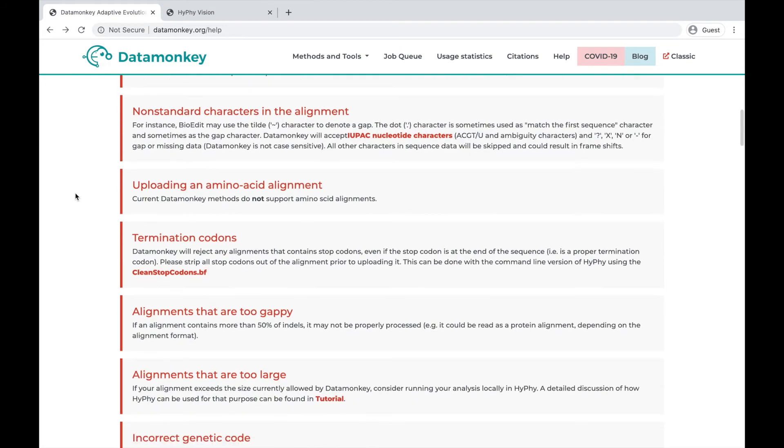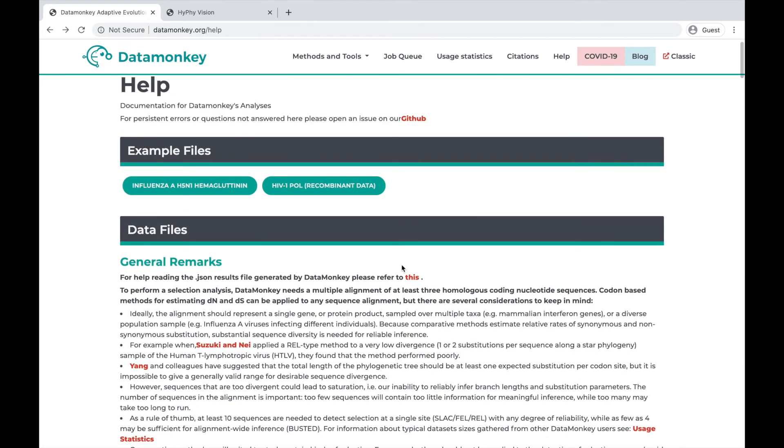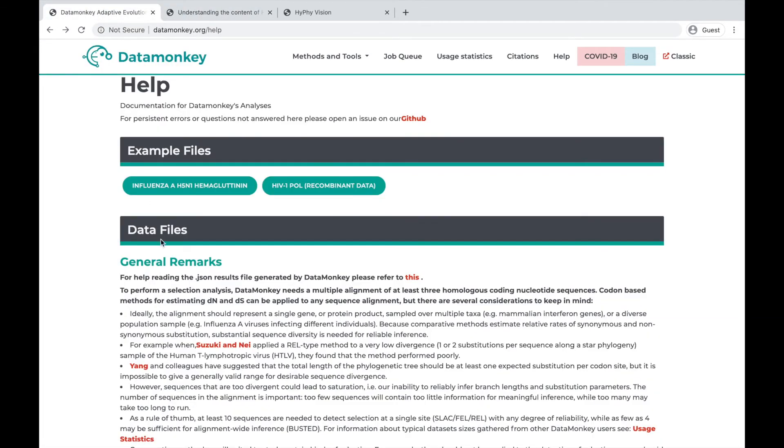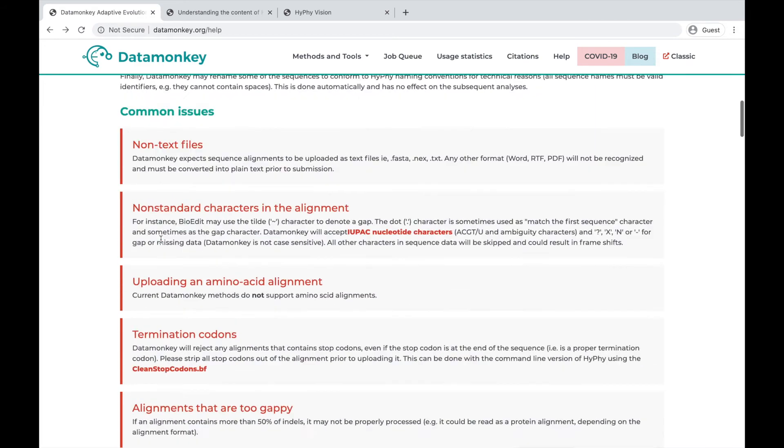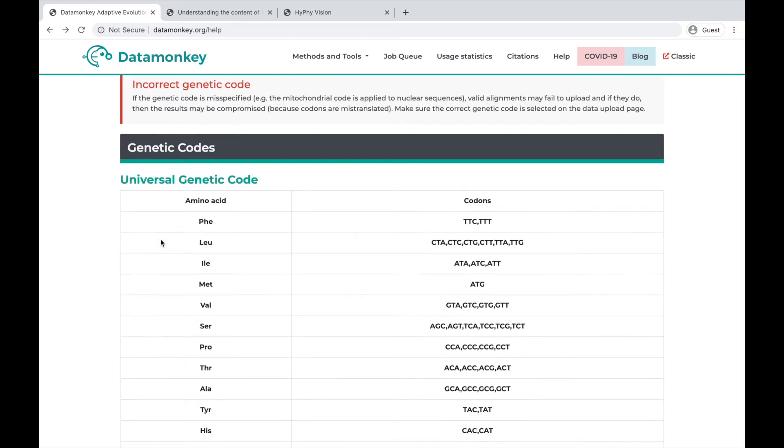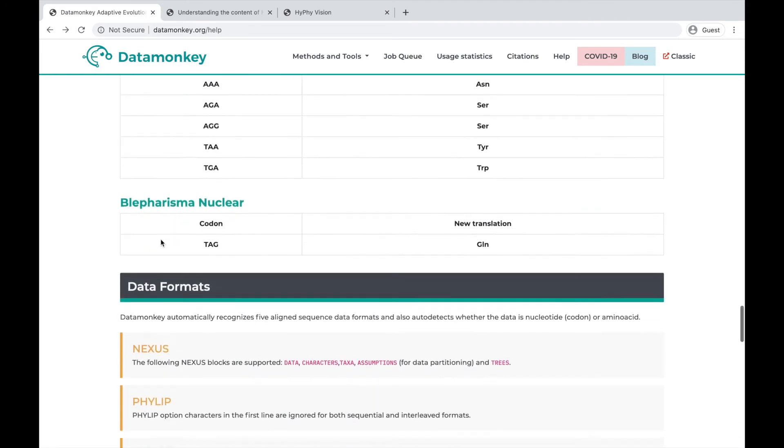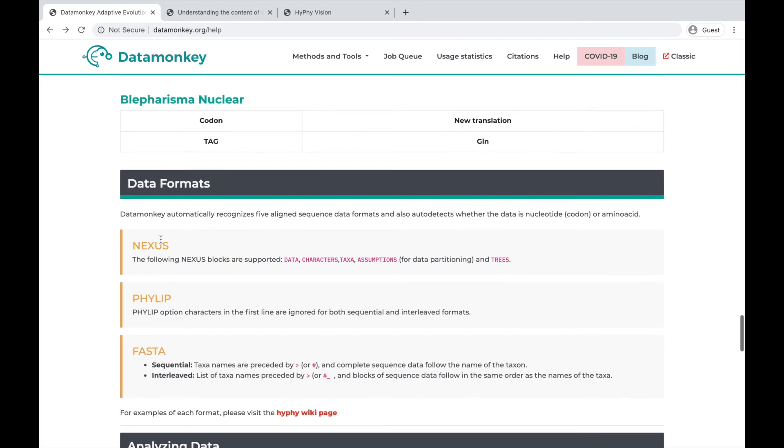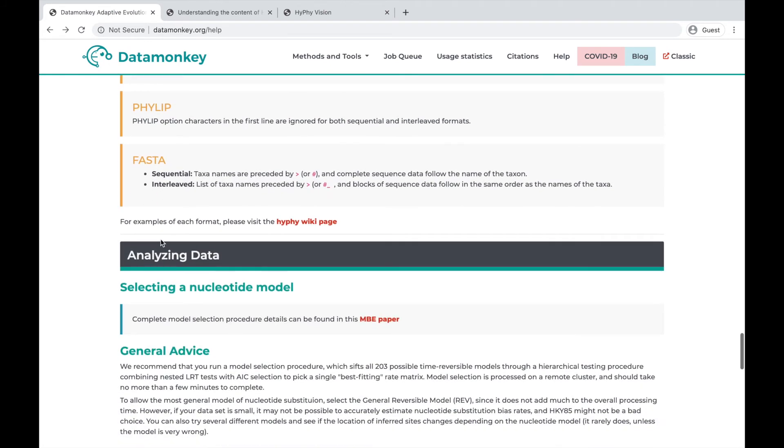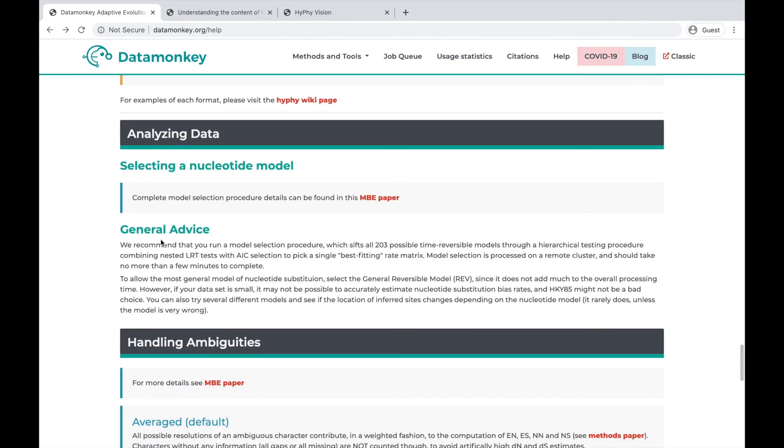It also includes a link to a tutorial about how to read the JSON results files generated by Datamonkey, as well as lists our genetic codes that we use, and the type of data formats we allow, as well as just some general advice about statistical analyses.